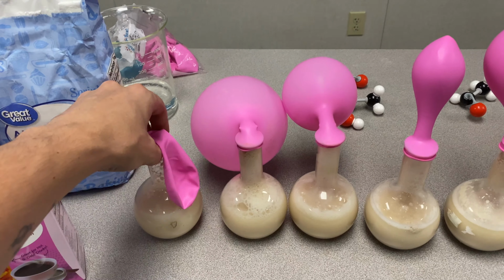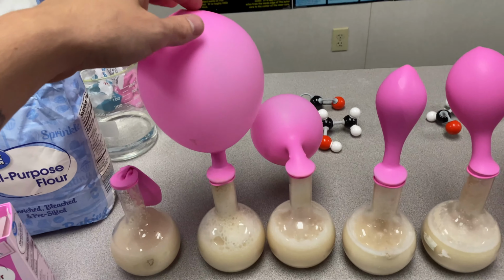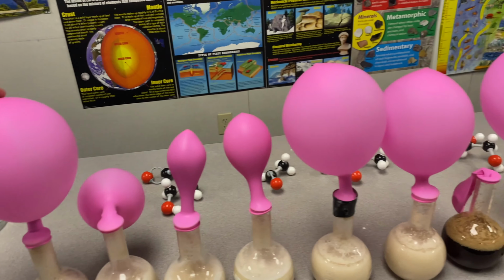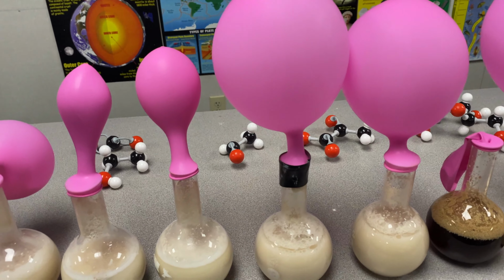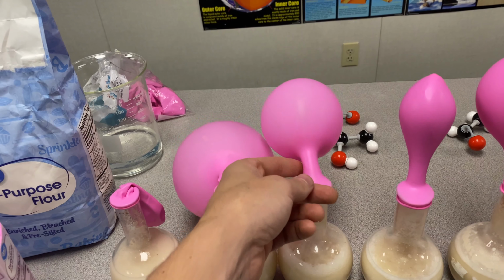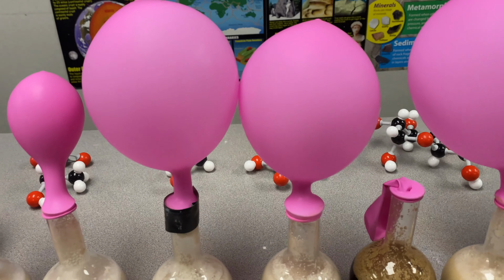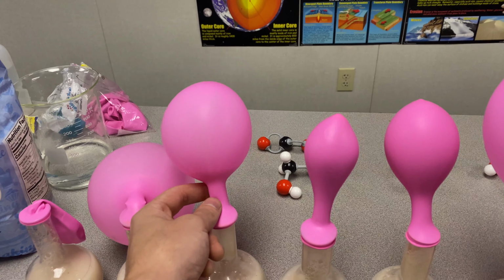The control flask, still absolutely nothing happened here. We got some spillover into the balloon, but the 10-gram flask, 10 grams of sugar, has gotten quite large. It's pretty much the same size as the apple juice flask and the 10-gram flour flask. Now, the 20-gram sugar flask, it did grow, but it never got as big as any of the other ones. Whereas the 20-gram flour, not as large as the 10-gram flour, but significantly bigger than the sugar.